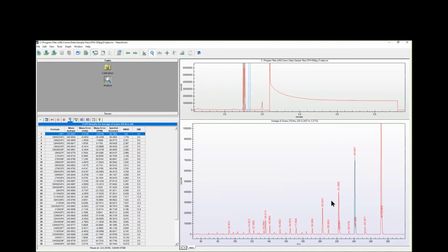You can't resolve them spectroscopically. But for reasonably clean, well-separated peaks, you can do a bang-up job using our approach with a single quad, and you'll get comparable results to a TOF for those samples that you have a good enough sensitivity and a clean enough sample.